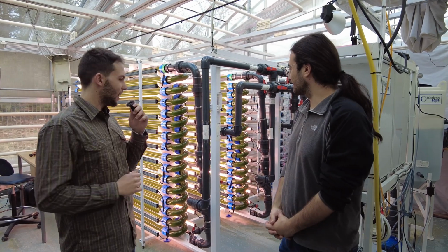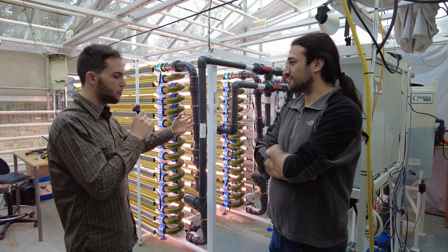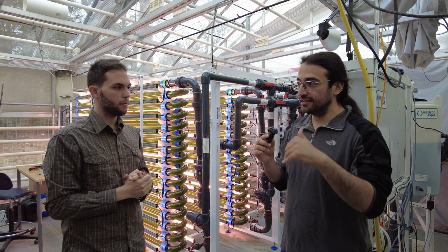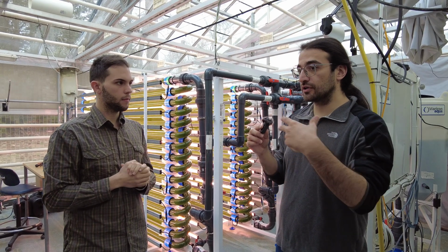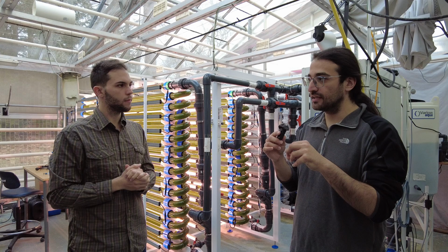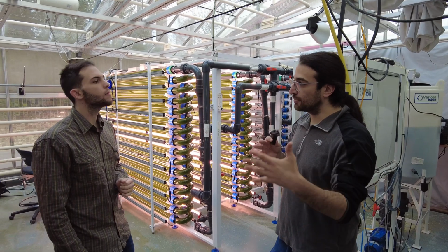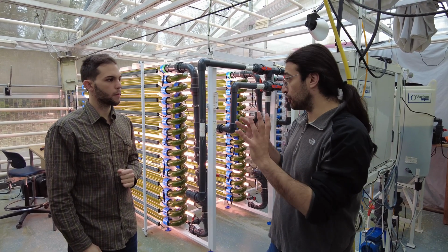Hey, so this looks like a bigger, more complex, and very cool version of the previous system. What is the difference between those two, and why do you have this bigger version? Actually, this bigger version is one of the deliverables: we have a validation plant here at the University of Turku, and in our EU projects we are creating a recipe for the private sector to treat the hydroponic greenhouse effluent in a way that they can produce more algae biomass. They can use what we are validating in this PBR, and with that recipe our collaborators in the EU projects will grow algae on a bigger scale, up to 100 square meters or 80 cubic meters volume in open ponds.